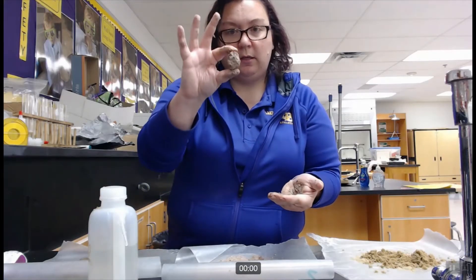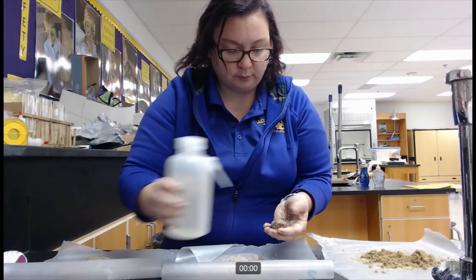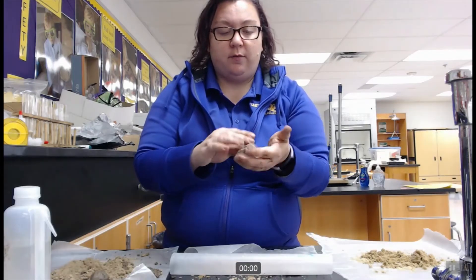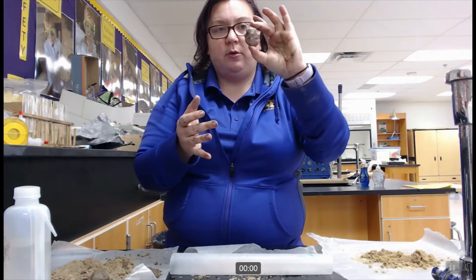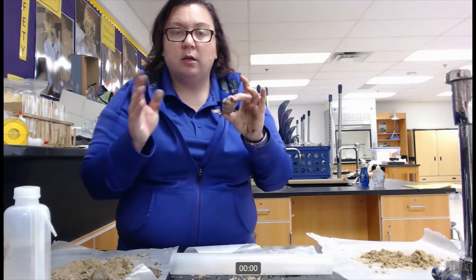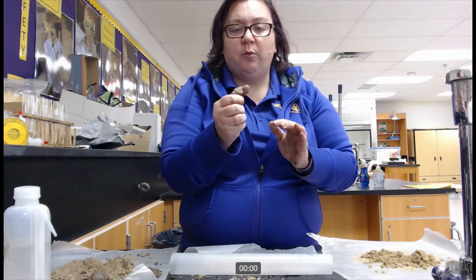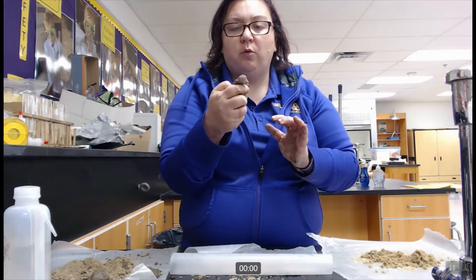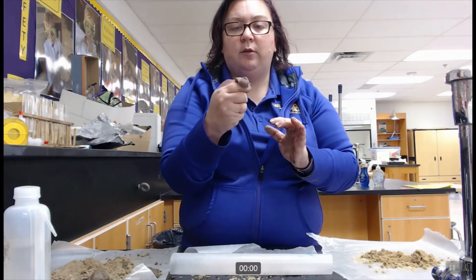Already I can see a difference — when I hold this up, that ball stage stays. I have kneaded it, it is nice and moist, and we can clearly see that it is able to hold on to that ball shape and does not fall apart. Now I will perform the ribbon test. I just want to push it through with my fingers and see how long I can push it before gravity breaks my ribbon and it falls to the ground.